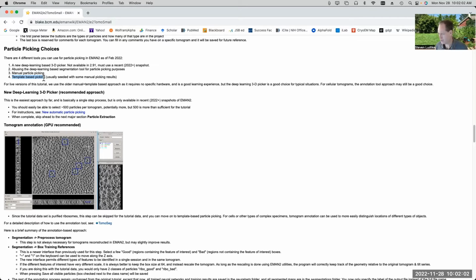You'd say, well, that difference shouldn't be such a big deal. It's really just sort of a little darker or something like that. It actually can have some significant impacts when you're trying to use them as templates for 3D picking. The other factor for template-based picking is the more details you have in your template, the more computationally expensive it is to compute.